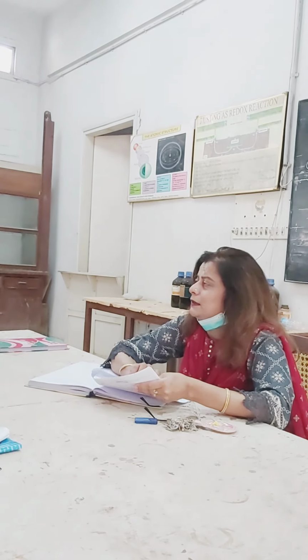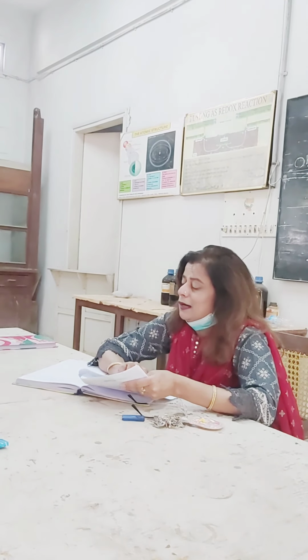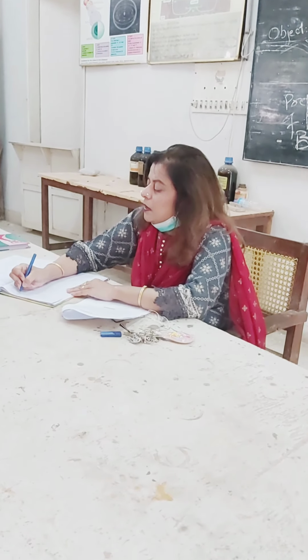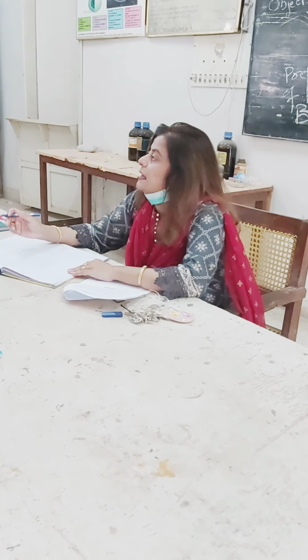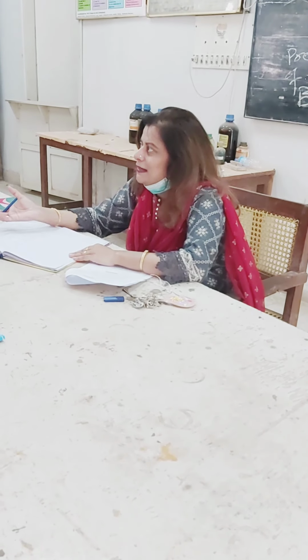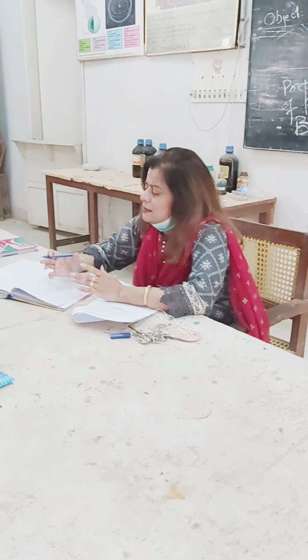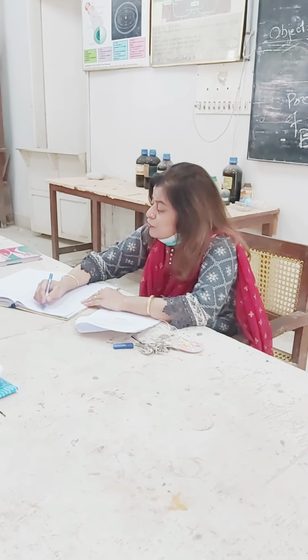Now there are various methods to prepare para-nitroacetanilide, but we have selected this method in which we are going to nitrate acetanilide. Now what is nitration? There are a few things which you are supposed to know. Nitration is a simple method of producing a nitronium ion, and that nitronium ion attacks the ring, right? It is simply a two-step reaction mechanism, right? So we just go through this nitration reaction first.